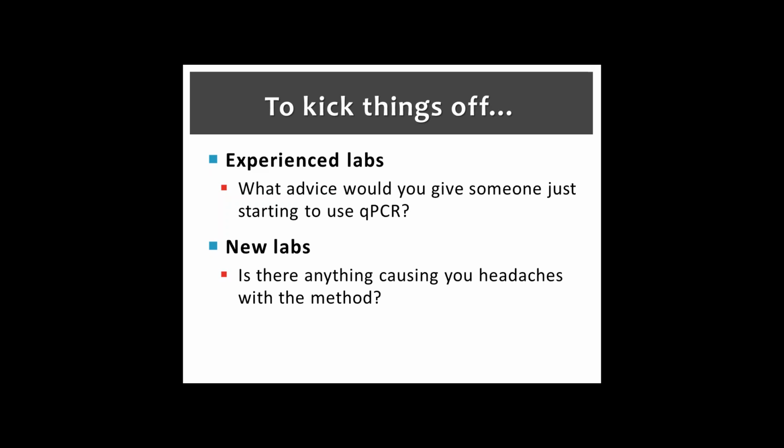Do you understand the question? You mean that you get a qPCR signal from your filtered water sample as a negative control. We usually don't use filtered water. You can filter the water, but make sure you autoclave it and UV it, because filtration will not remove the DNA from your water samples. But you can buy PCR grade water. Yes, you can buy PCR grade water. Usually if you buy a PCR reagent master mix, it will come with the PCR grade water. So use that for your negative control.